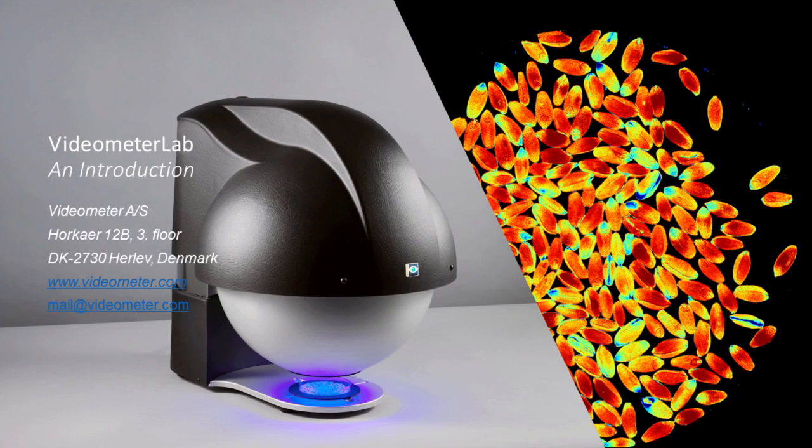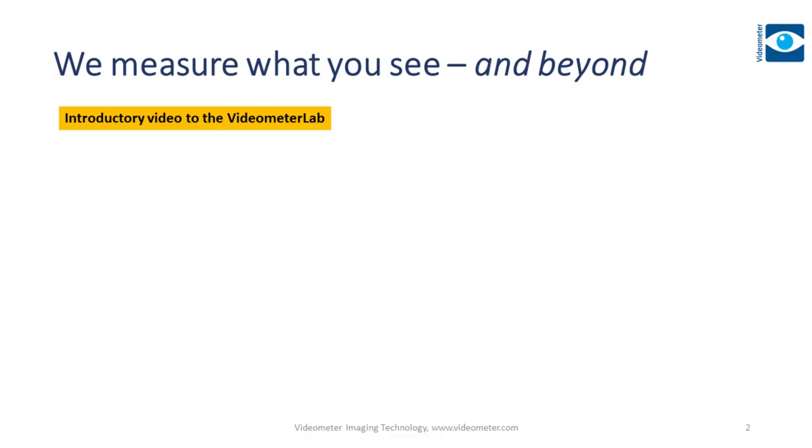This short introductory video will go through the basics behind the technology of the Videometer Lab and some examples of use cases. The video is intended to give new users the necessary basic information and an introduction to the Videometer Lab and its software before beginning the 4 training modules.